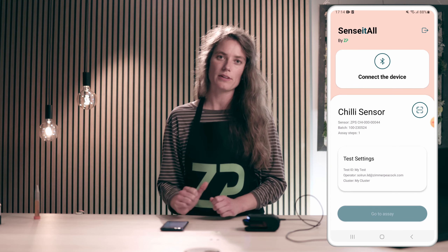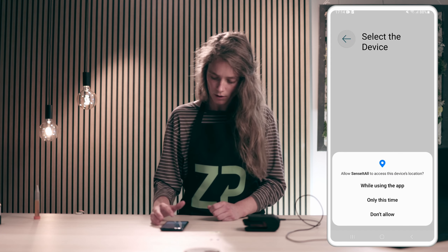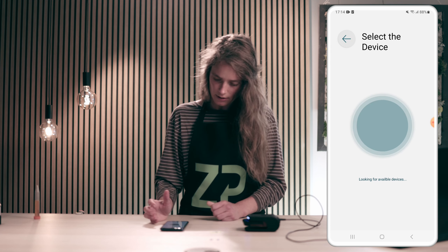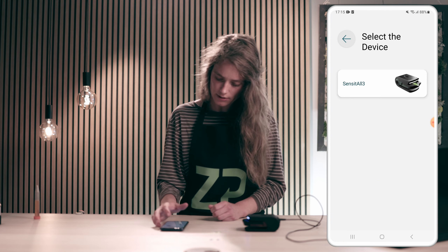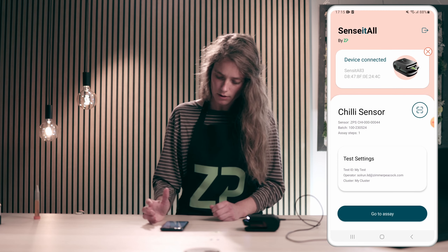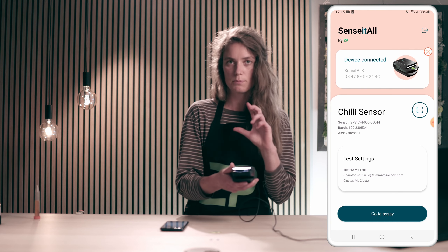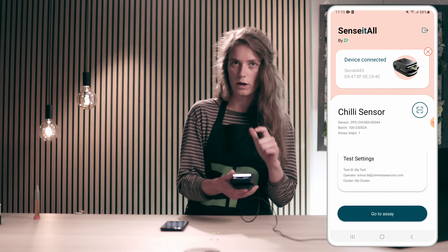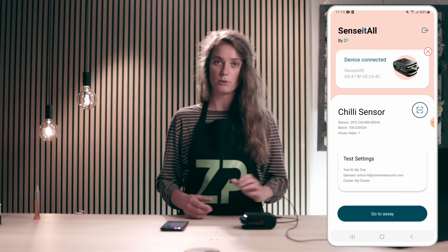The next step is to connect to the device. I will click the Bluetooth symbol and allow it to access the device's location. I'll give it a few seconds to find the SenseIt All device, then click this symbol and the device is connected. You can now see that the blue light that was blinking — indicating it wasn't connected — is now turned white, which indicates a successful Bluetooth connection.